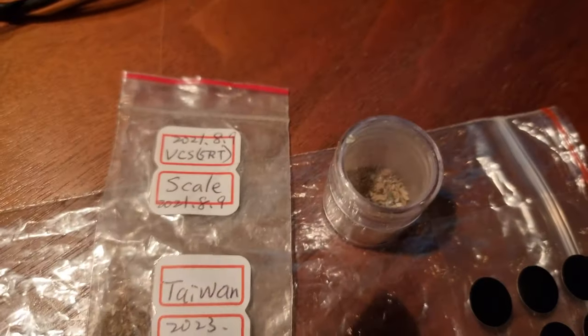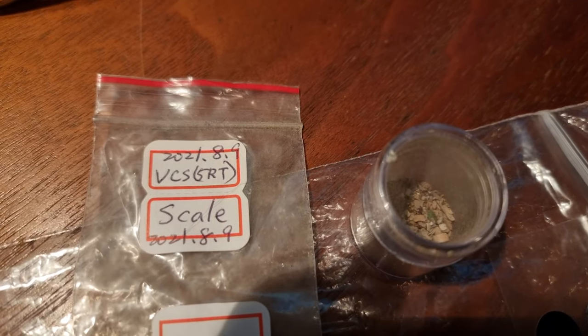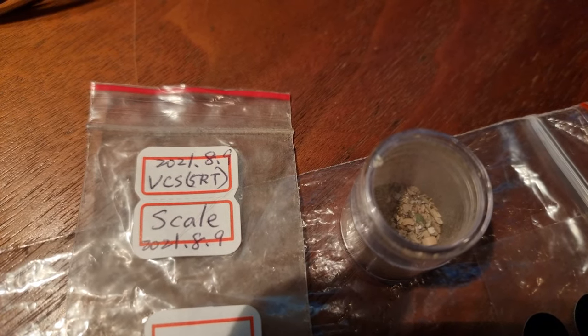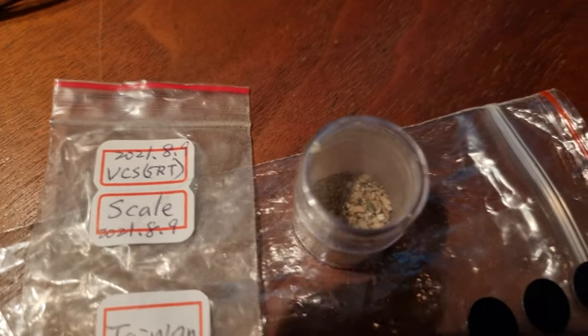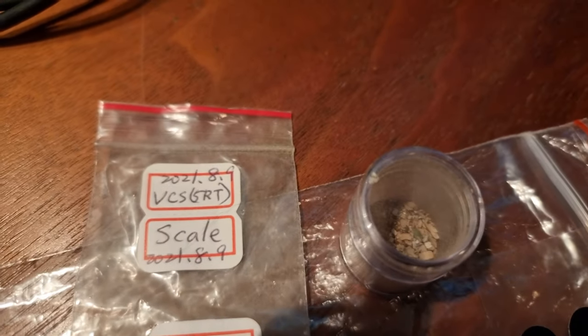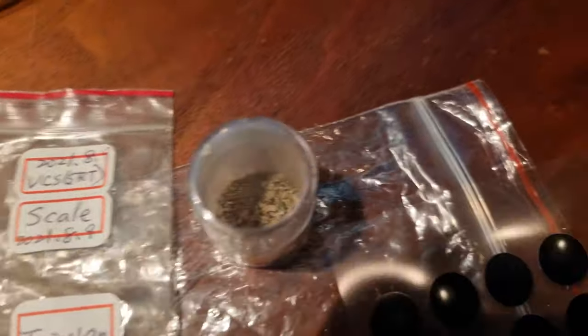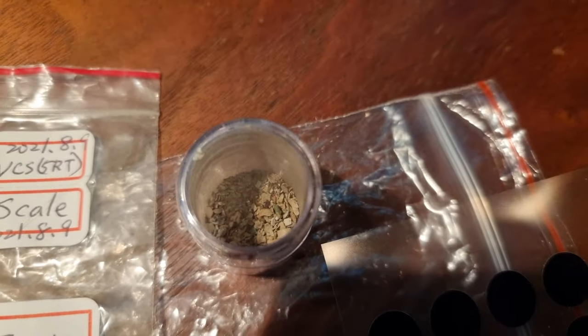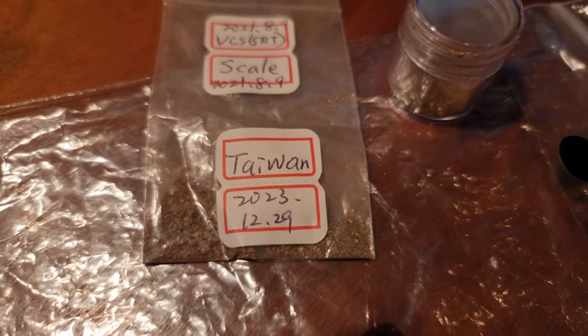So today we're going to look at some samples from the VCS-5RT that was done in August 2021. These were extracted scale samples from 9th of August 2021. And this is the balance of the material in here, in this sample container. This bag has material which I extracted, some magnetic components which are in there. You can see those kind of black things at the bottom of this container here.